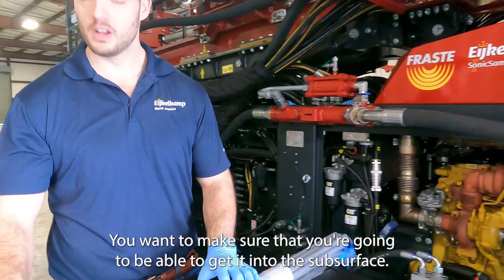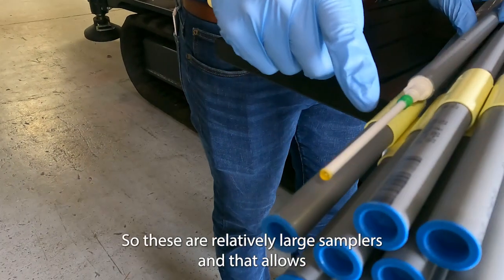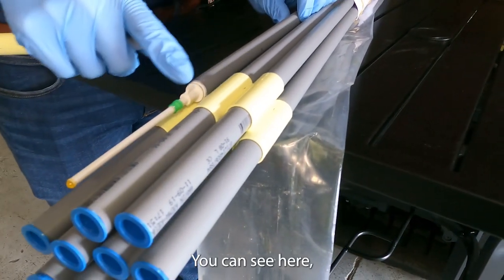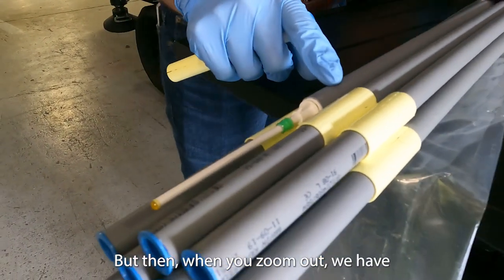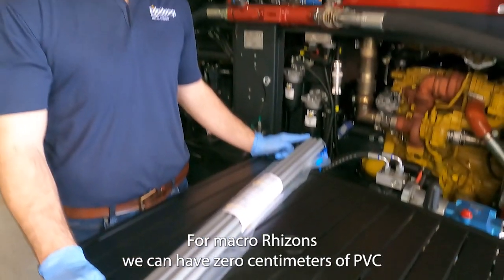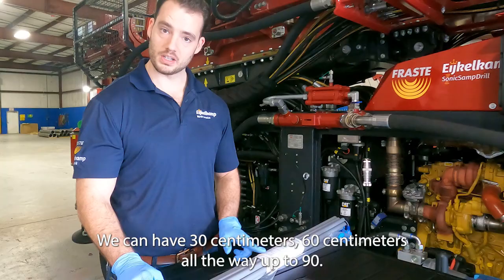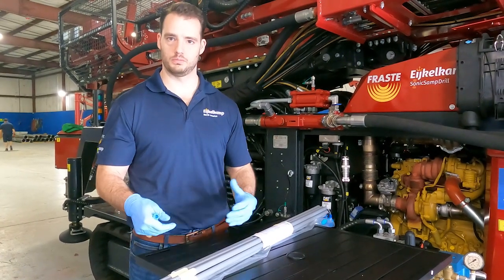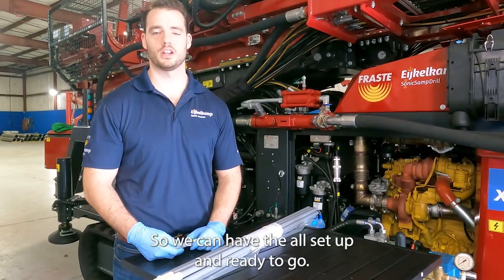You can see why they're also called macro — they are pretty large samplers and that allows for a larger volume of sample to be collected. This is the porous sample part, the active area, and then when you zoom out this one has 90 centimeters of PVC. We have four different options for macro rhizons: zero centimeters of PVC where it's just the front tip, 30 centimeters, 60 centimeters, or all the way up to 90, depending on how deep you want to go and how much you want sticking out of the ground. There are also extension tubes and other accessories to get you fully set up.